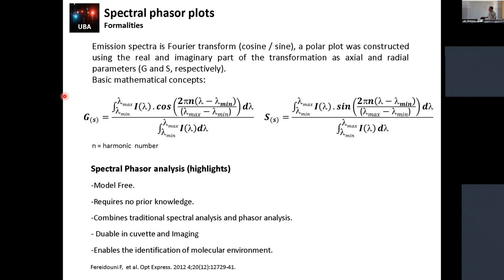And then, as Enrico mentioned, in our phasor transformation, we always normalize to the total intensity that we collect. This is very important because it's what warrants in our transformation that all the linear combinations and additions, etc., work. Otherwise, you cannot claim for these properties. And this property will be very, very important for the analysis that we would like to have.